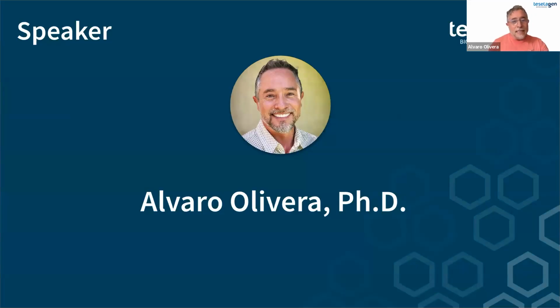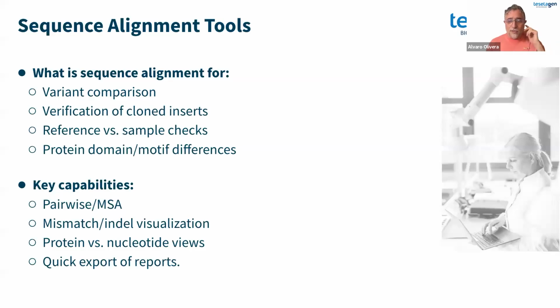Today I will be introducing two Teselagen design tools for molecular biology and for analysis and experimental design. We will talk about the sequence alignment tool and the PCR and primer design tools. We have talked about other tools in previous webinars, especially the one Eduardo mentioned for DNA assembly. So today we will focus on sequence alignment first.